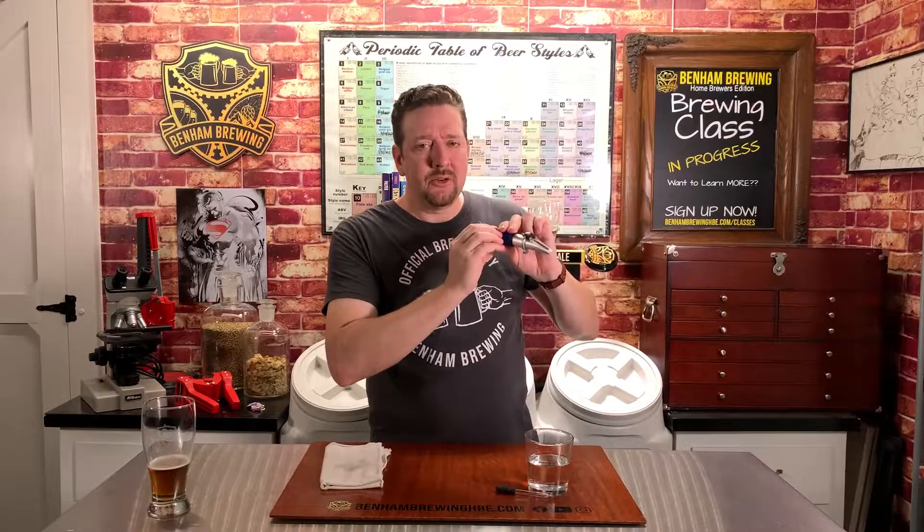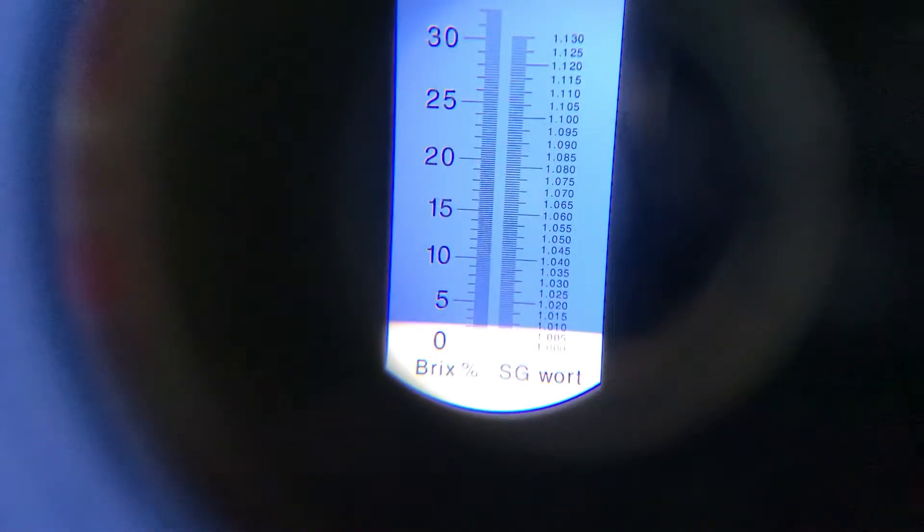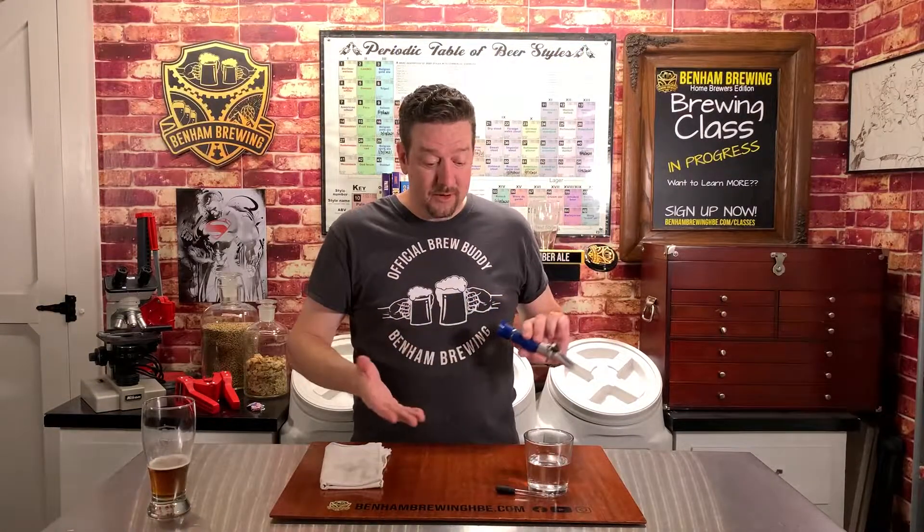Take the refractometer and point it towards a natural source of light. You don't really want to use fluorescent lights or anything else because it can throw off the readings. A natural light source is great. Focus the eyepiece and read where the blue line and the white line join — that will tell you the gravity of whatever it is you're trying to measure.